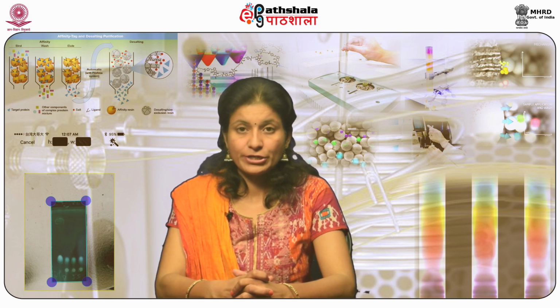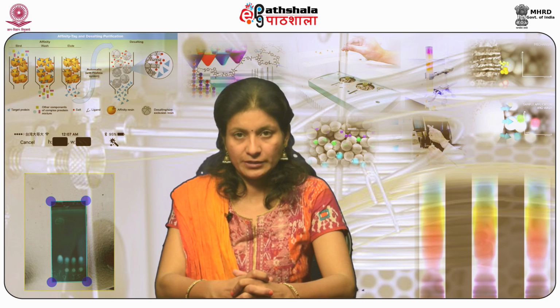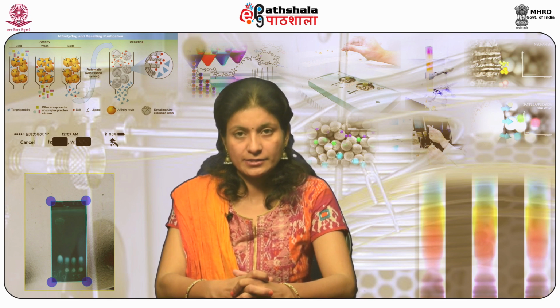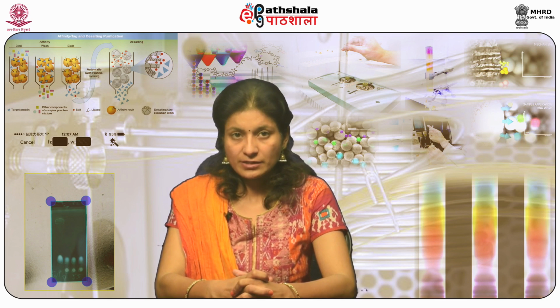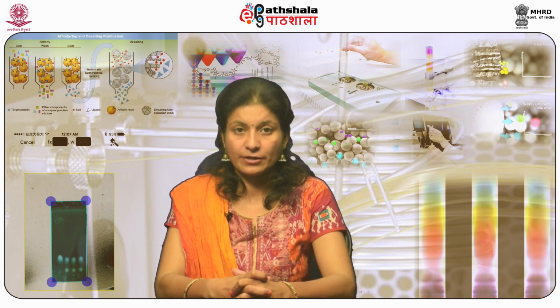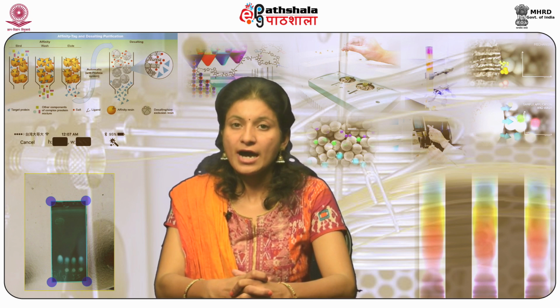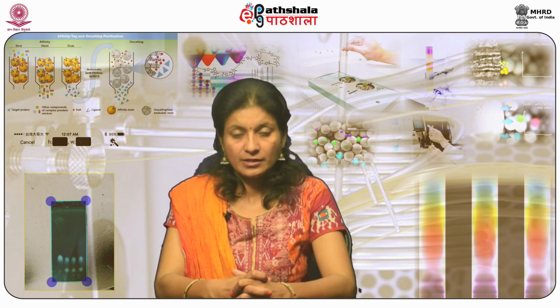Advantages of gas chromatography. There are numerous advantages of gas chromatography. With the gas chromatography analysis, it is very fast because of the highly efficient nature of the separations achieved. There is high efficiency leading to high resolution and a very high precision.